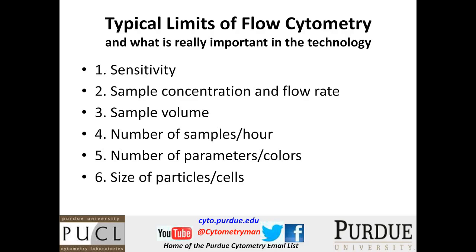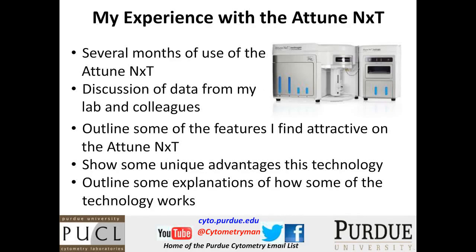And that's because we've really developed some good assays where we can get assays running with a fairly small number of cells and still be able to look at a vast number of parameters. The last thing is a tricky issue, and that is looking at size of particles, small or large particles. And that's a tough one for a lot of flow cytometers. So looking at very, very small particles is something that I'm seeing a lot of flow cytometry doing. And so I anticipate we'll be looking more at that area.